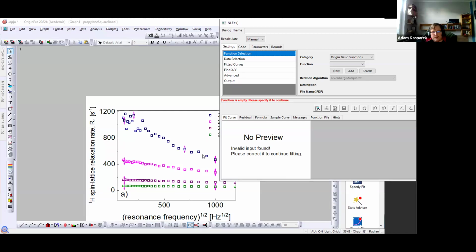There will be some changes depending on whether I start, for example, here, or here. It shouldn't change much because we expect it to be linear. So this slope should be more or less the same, but there are always some errors during the fitting, and this error can show depending on where we start our data selection.